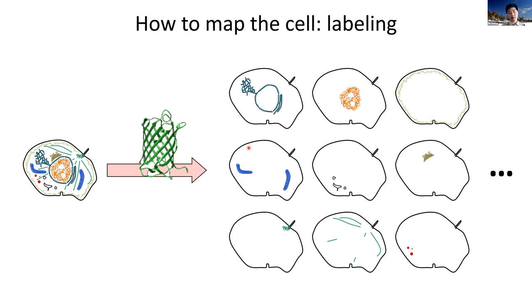cell responds to it. Basically, fluorescence microscopy is a very powerful analysis tool, because you label the protein of interest. Whenever you see the signal, you know where the signal is coming from, because that's the protein you have labeled. But that's also the biggest limitation of fluorescence microscopy, because you have to know what to look at before you label it and image it.